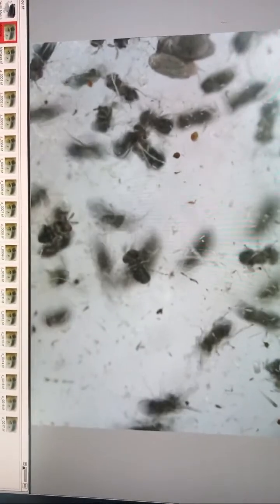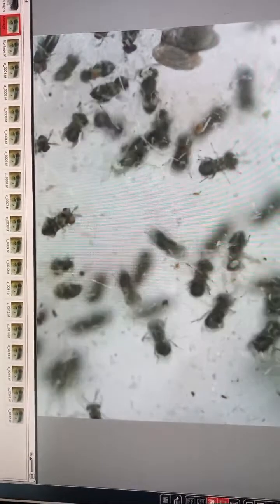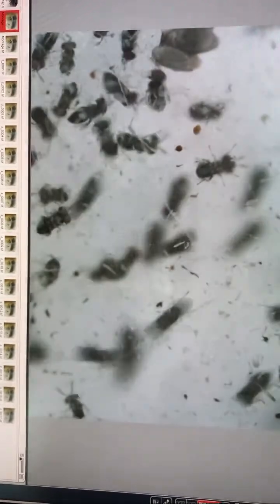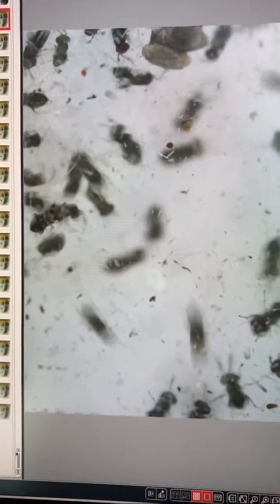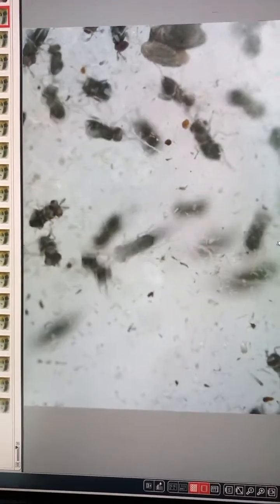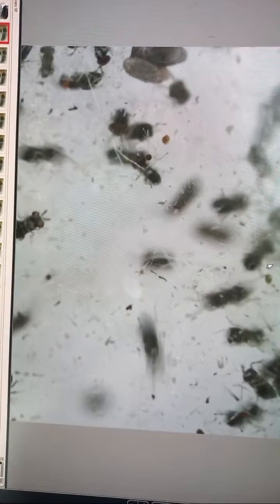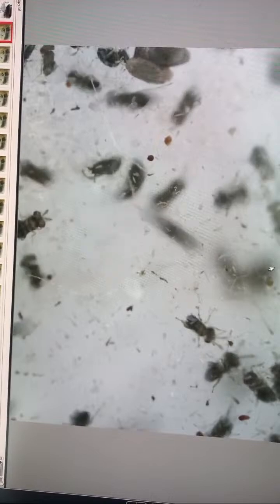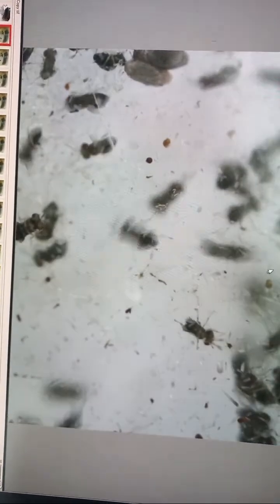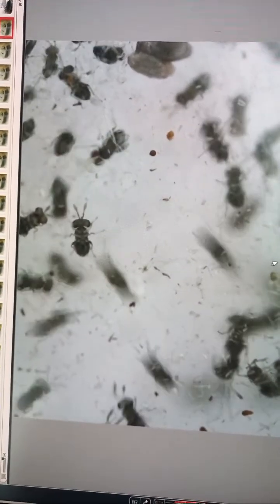No, they just escaped. Mating process can be very short time, just few seconds. Not very quick, not very long time. Because here too strong competition, many males, many females. So they're just disturbing each other. They're crowding in different directions because of light. They're searching for host eggs. I cannot give them host eggs because in my laboratory I do not have culture of moths.